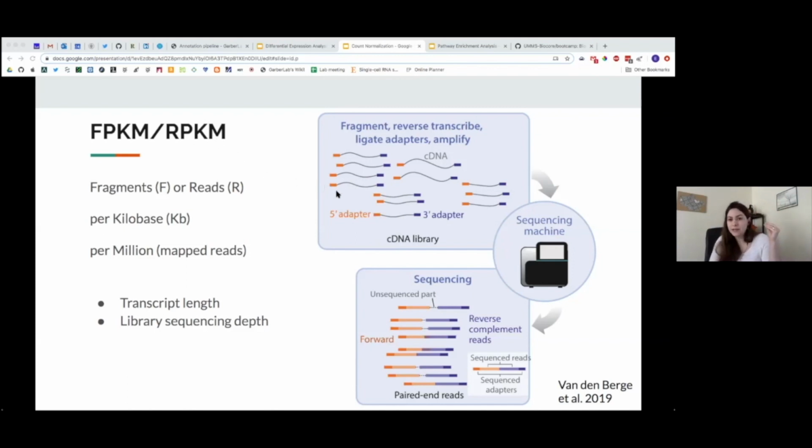But in the case of paired end libraries, if we used read information, we would be artificially doubling our read counts. That's because we sequence both ends of the fragment. So what matters is actually the pair of reads and not each read by itself. So they renamed this method to FPKM so that you know you're not talking about individual reads, but you're talking about how many fragments from your original library you have a representation for in your sequence reads. I hope that makes sense. And that's the only difference between FPKM and RPKM.